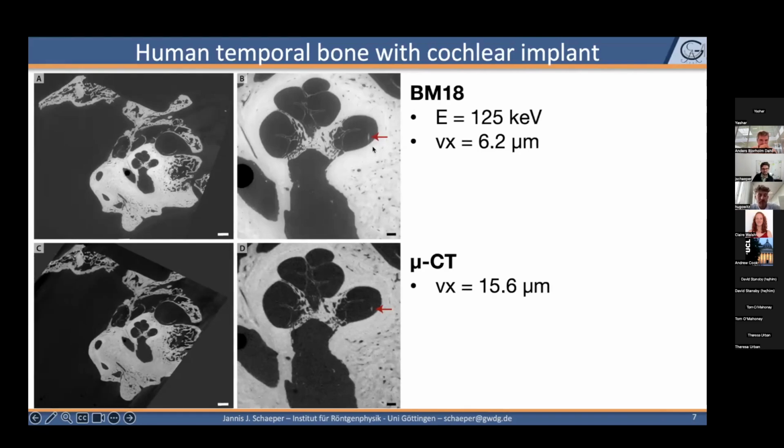So it's very reduced to a small region, which you would usually have. But we also don't see the fine soft tissue in the cochlea, which I will show you for a sample at a later stage. But for the implant positioning, that is reasonable.